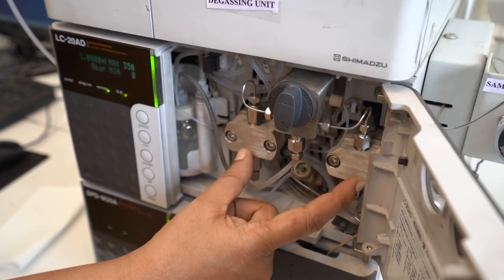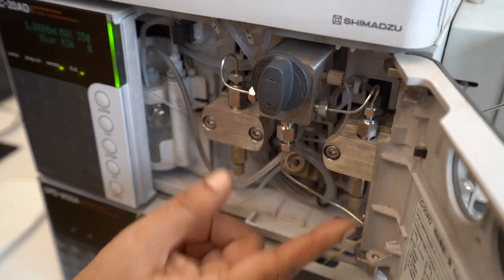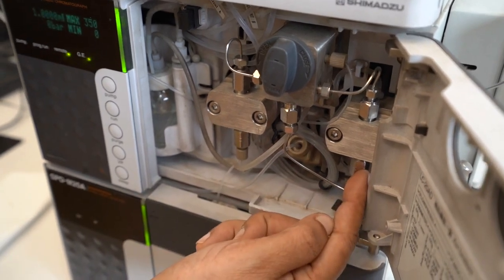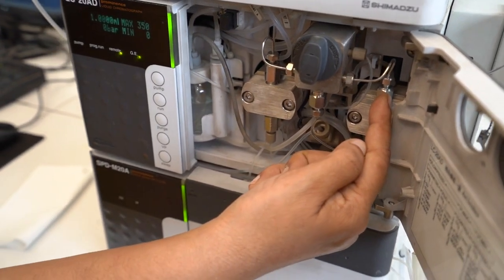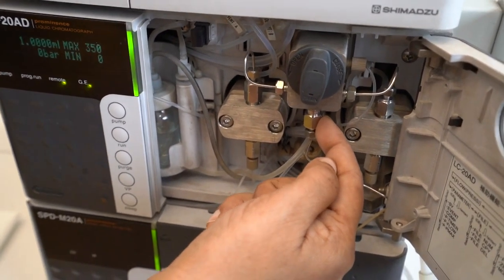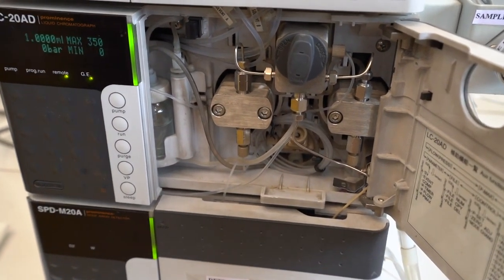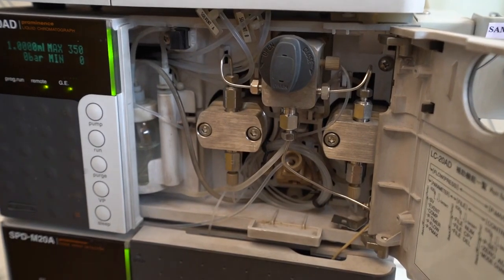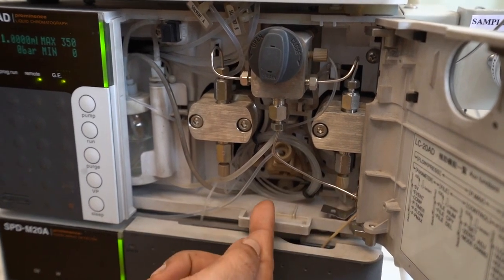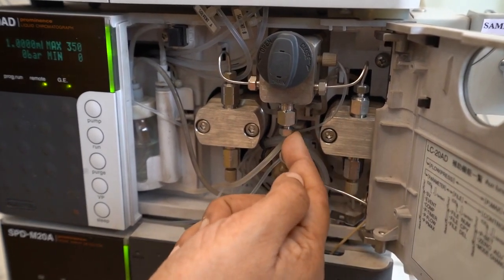This is the double head reciprocating pump which is used in HPLC. What you see over here are called the pump heads. This is called the pump inlet. This is the inlet check valve. This is the outlet check valve. This is called the pump outlet, and this is called the line filter, which is in the flow of the mobile phase to remove any particulate matter that may be entrapped in the system. The mobile phase enters a pump through the pump inlet, through the inlet check valve into the body of the pump, and exits the pump through the outlet check valve and the pump outlet.